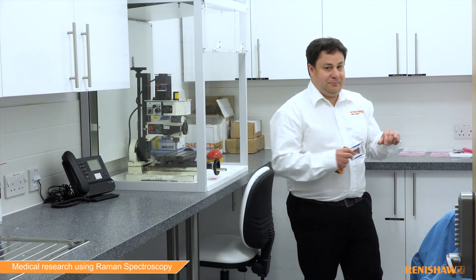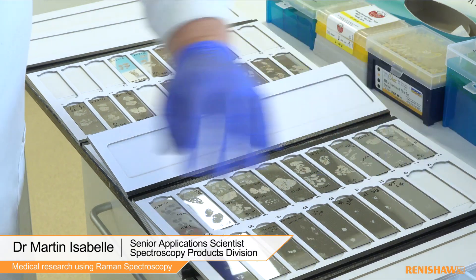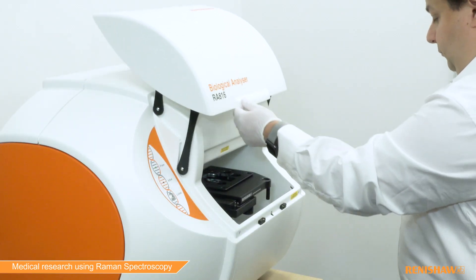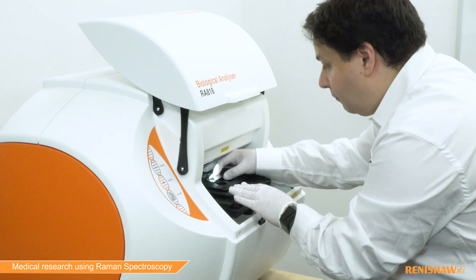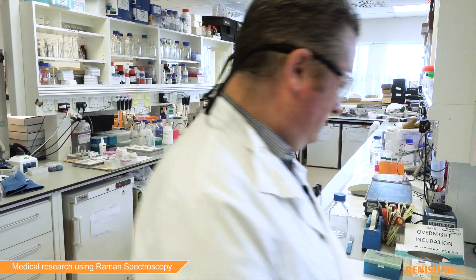Current medical diagnostic techniques allow clinicians and researchers to obtain information about proteins, genetics, and metabolite expression levels related to the initiation and progression of disease. Some of these techniques require contrast agents and labels, which can be costly in time and money for research institutes and hospitals.